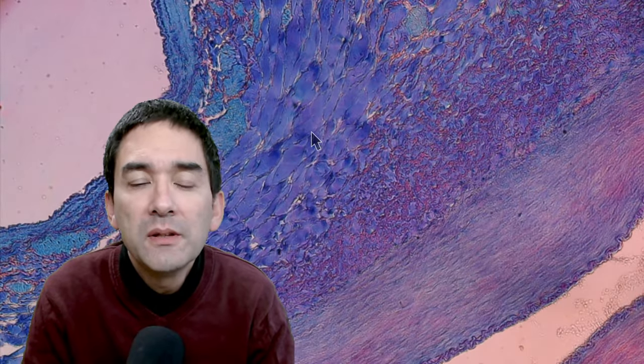I suppose also a lot of collagen fibers, to make sure that the blood vessel is strong enough so that it doesn't burst. And then over here, you've got the remaining tissue, maybe some muscles. You might be able to see some other structures, fat tissues, and so on. Connective tissue, as I said before.